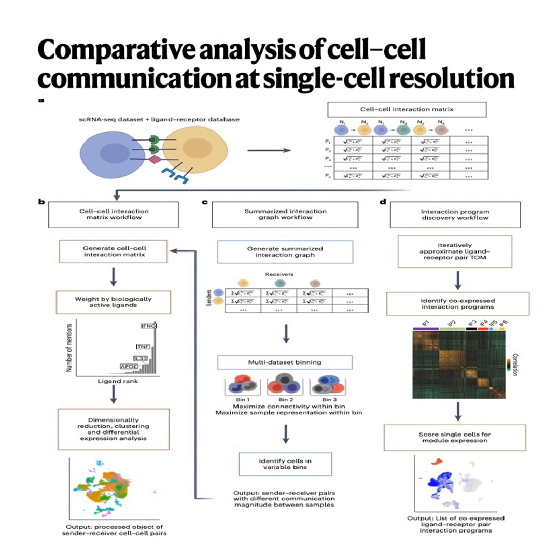Okay. So the geometric mean says these two could talk. Then cell ID defines the receiver's current state, and NicheNet looks at that state and asks, okay, which incoming signals, which ligands are most likely causing this specific state? You got it. If NicheNet points to a specific ligand as being highly active, likely driving the receiver's gene expression, Scriabin then increases the weight of interactions involving that specific ligand. So it turns up the volume on the conversations that seem to be having a real impact. Exactly. It refines that massive potential matrix into a map of likely functional communication.